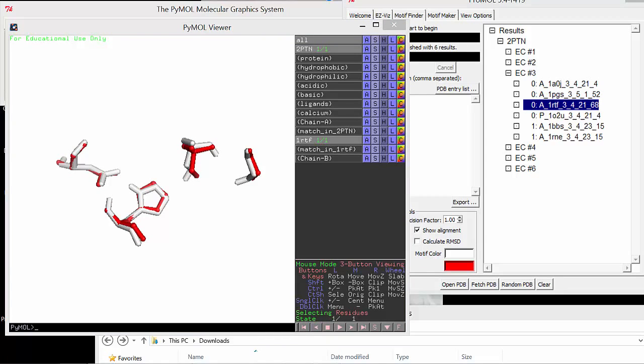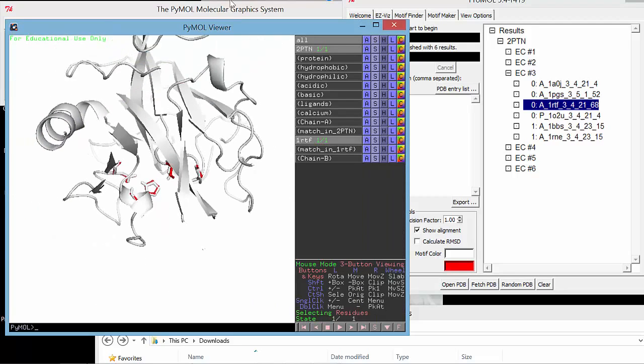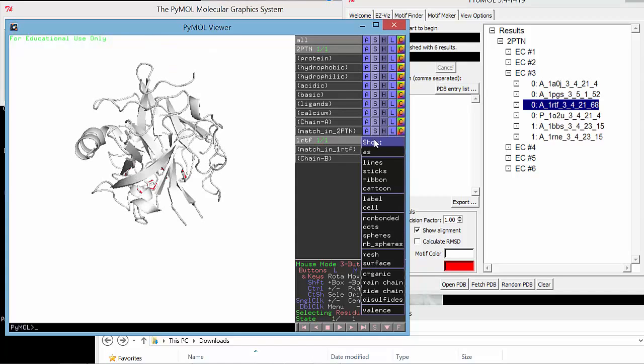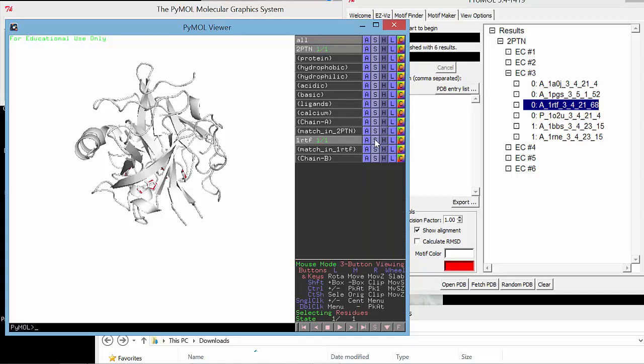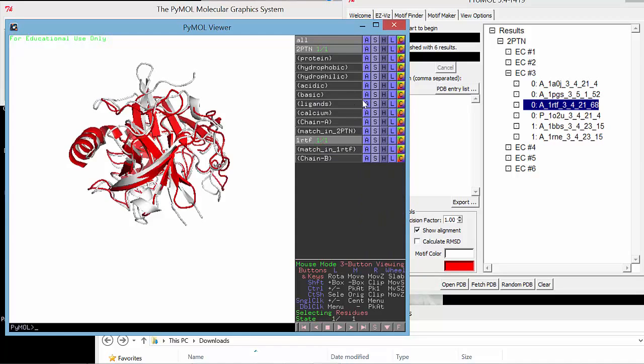RTF. So this is TPA, tissue plasminogen activator, another serine protease, somewhat different than trypsin. If we turn on the full protein and zoom out, notice what I did, I went into the hit protein, the RTF, and then I took the target protein as well, and I'll turn that on. These are pretty similar, a few differences here and there.